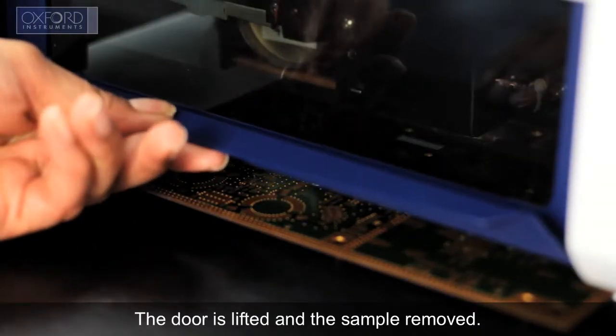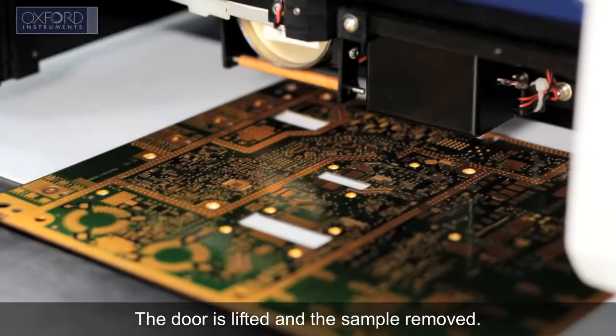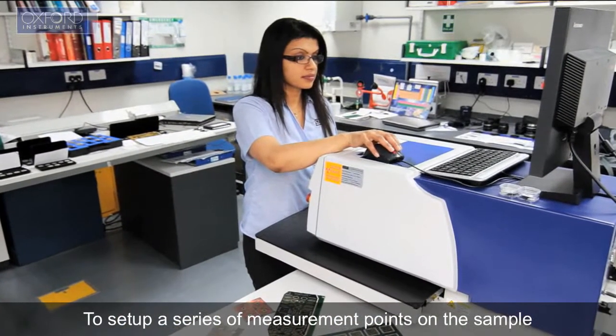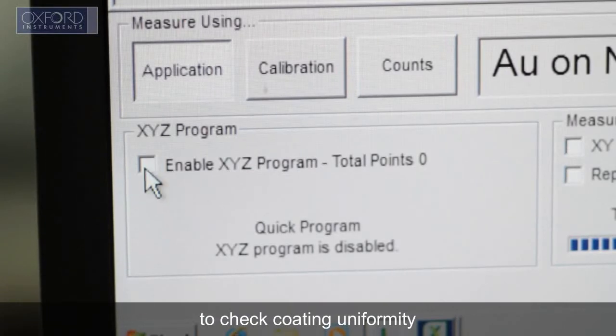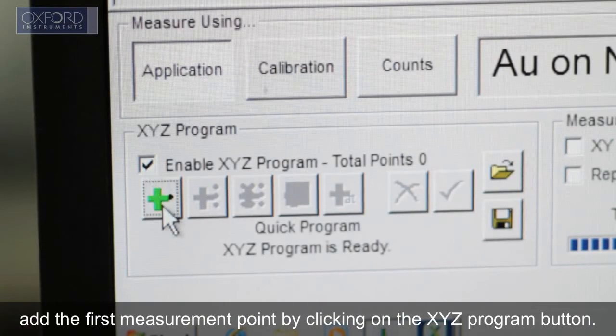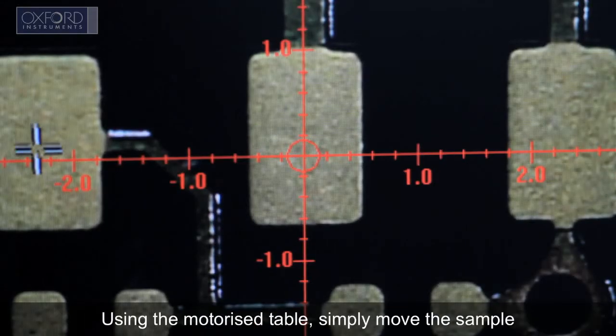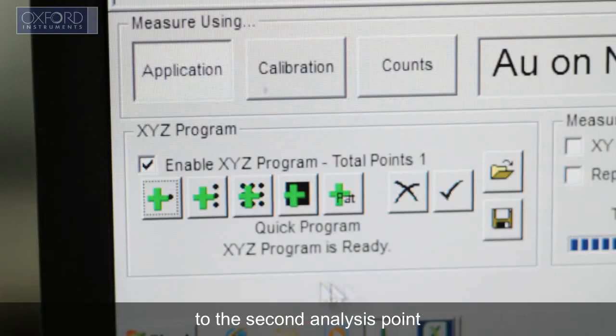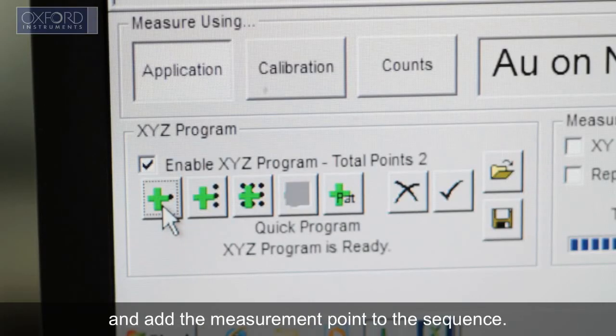The door is lifted and the sample removed. To set up a series of measurement points on the sample to check coating uniformity, add the first measurement point by clicking on the XYZ program button. Using the motorized table, simply move the sample to the second analysis point and add the measurement point to the sequence.